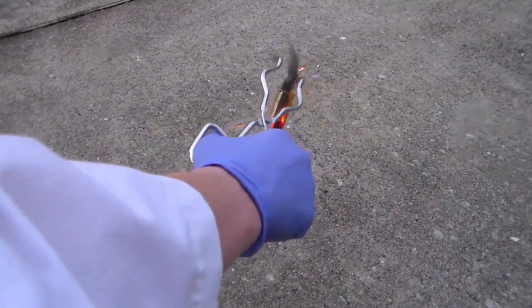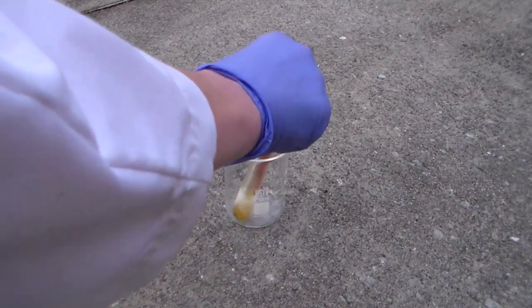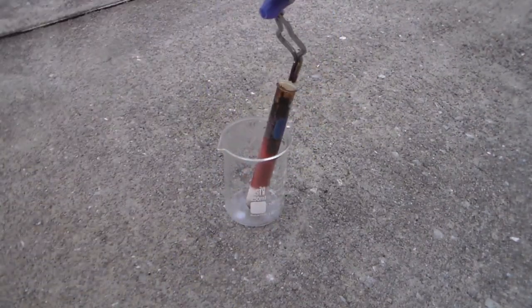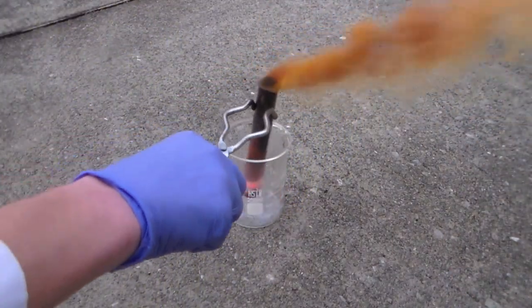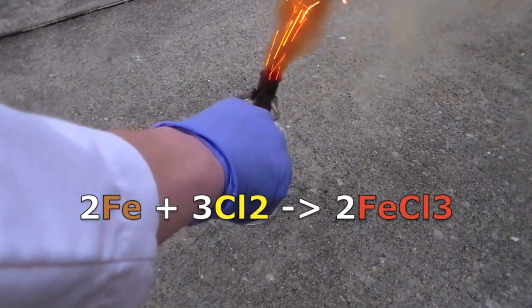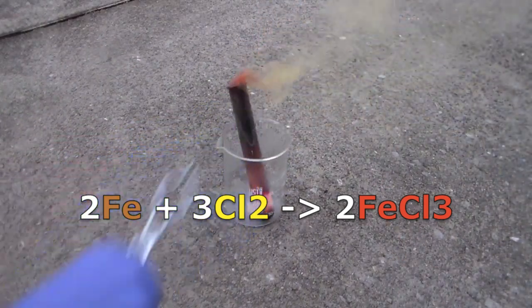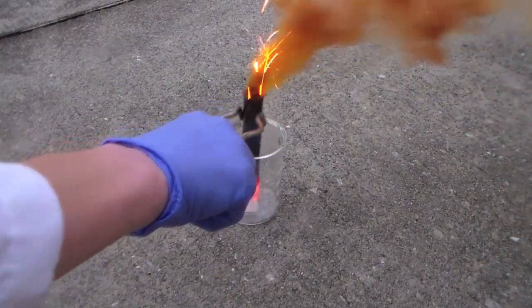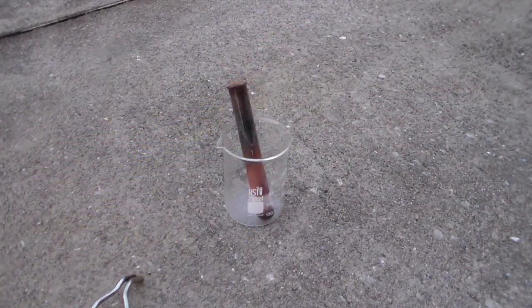There's actually not much reaction initially, but that's because the steel wool isn't contacting the liquid chlorine. However, when I shake up the test tube, the chlorine is able to contact the iron and it leads to a spectacular reaction. The red fumes produced are iron chloride. This reaction produces a lot of heat, which is evidenced by the sparks flying off the steel wool. If you look closely at the bottom of the test tube, you can actually see the iron glowing red hot as well.